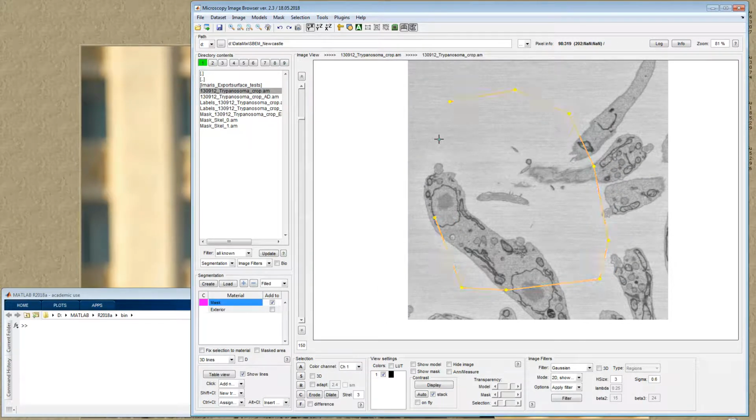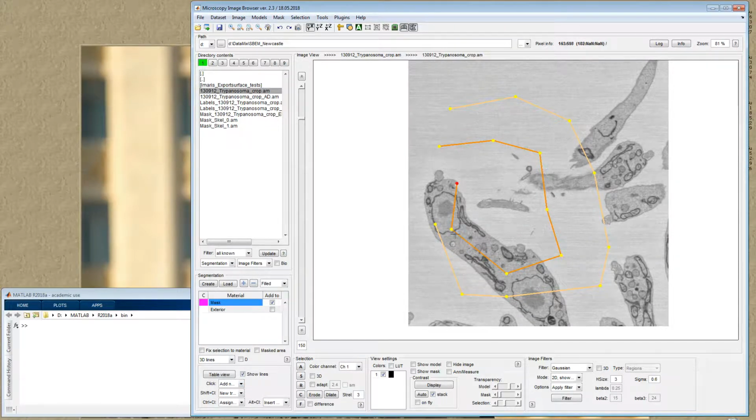Now, if we want another tree, we can also make it. In this case, I have two separate trees. To work with these trees, as I already mentioned, we use just mouse clicks. But these mouse clicks can also be extended with various key modifiers, such as Shift, Control, and Alt. Depending on what you're doing at each moment, you can assign various actions to any of these key modifiers. By default, a single click without any modifiers just extends a tree with a new segment.